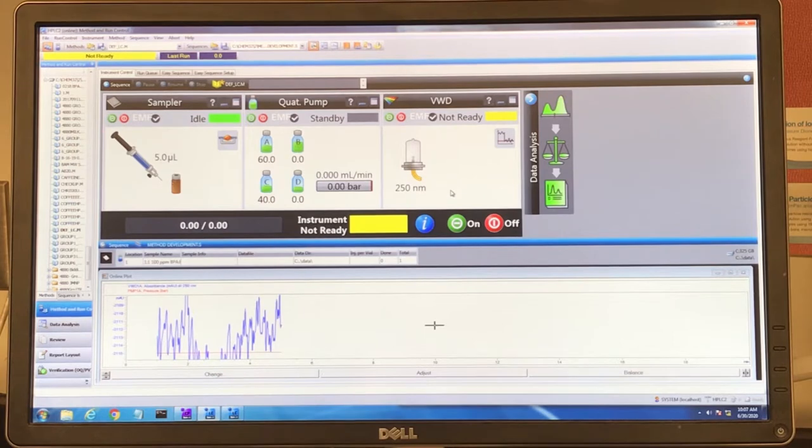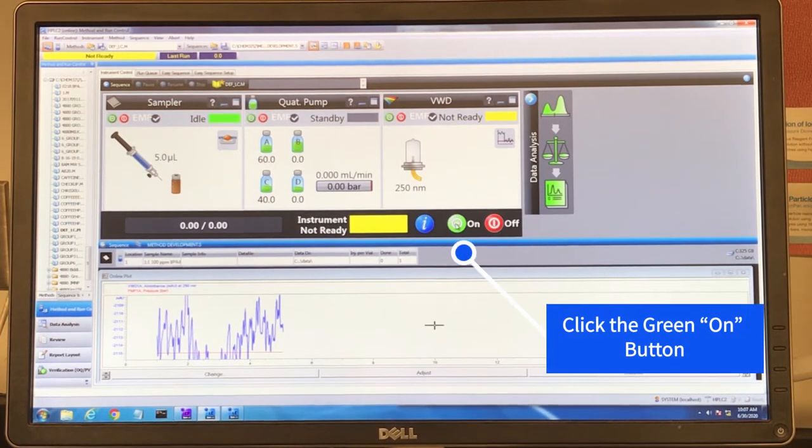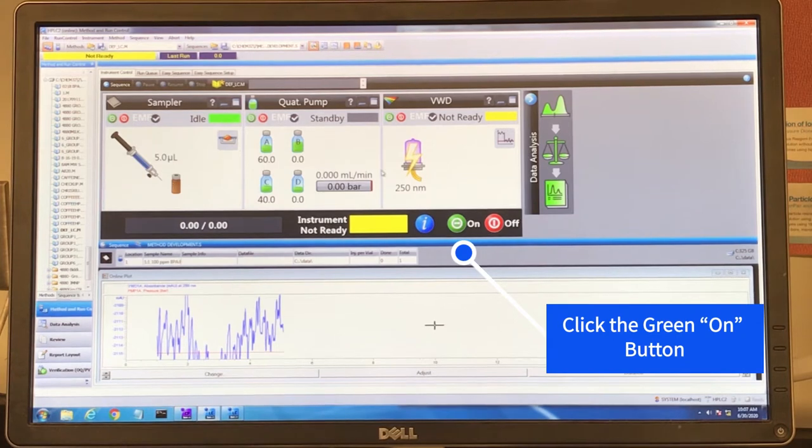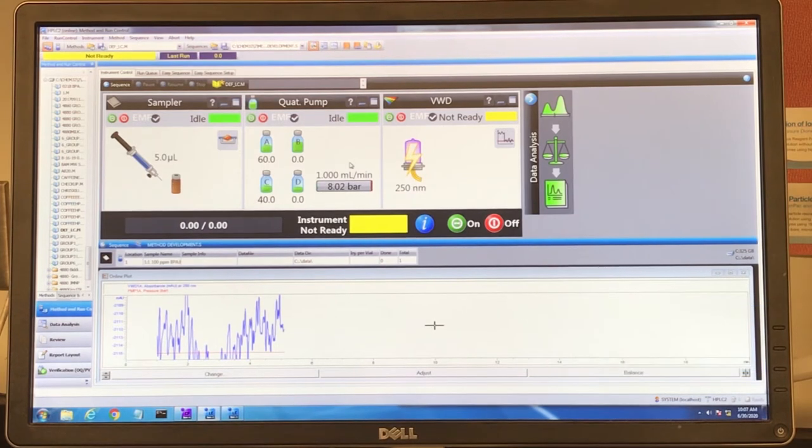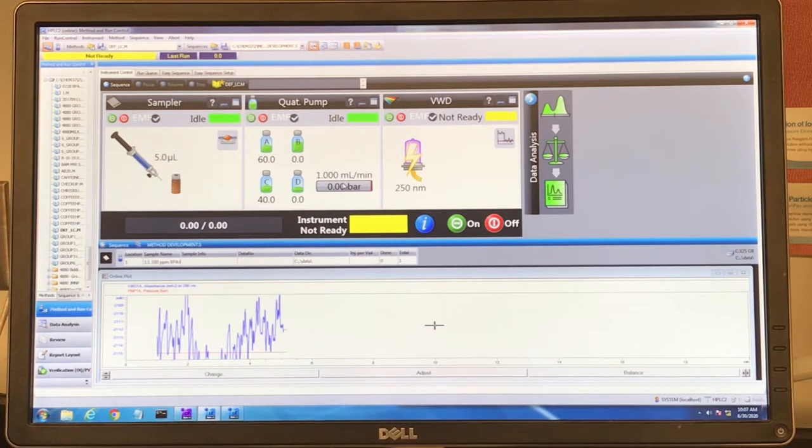Once the purge valve is open, we can turn the instrument on. The flow, the pump, should begin.